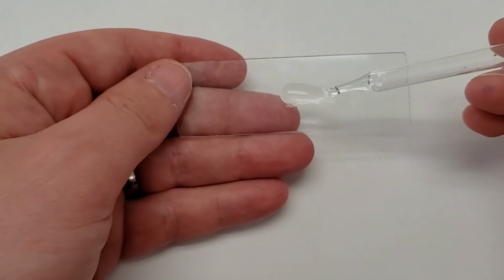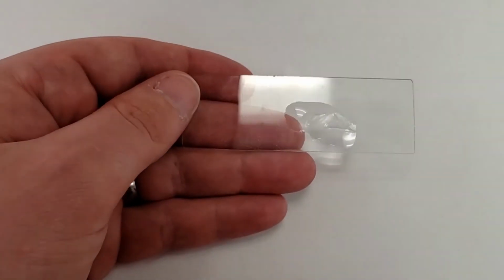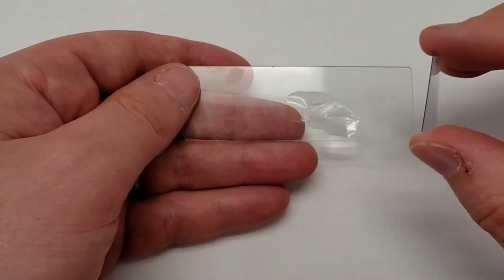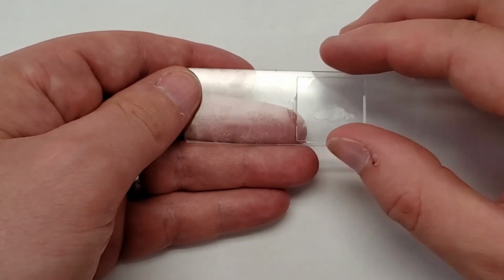Next, we'll take a cover slip and we'll touch it to the water at about 45 degrees from the slide, and we'll drop it onto our sample. If there are any visible air bubbles, you should probably try dropping the cover slip on again.